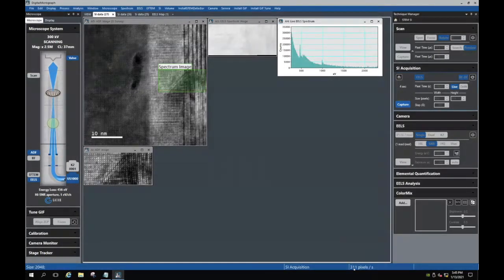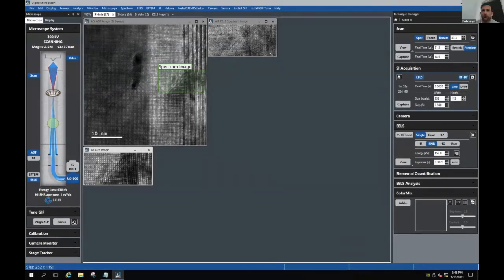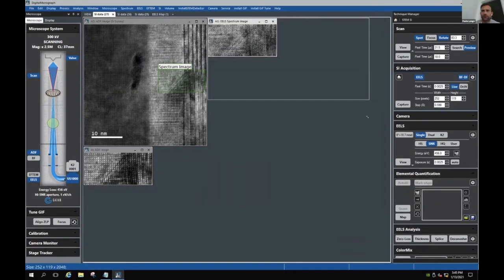But while it's a slower scan, we didn't move the sample. So note that the drift is improved. The sample looks as it should. That's very good. So let's check our data quality, first of all.